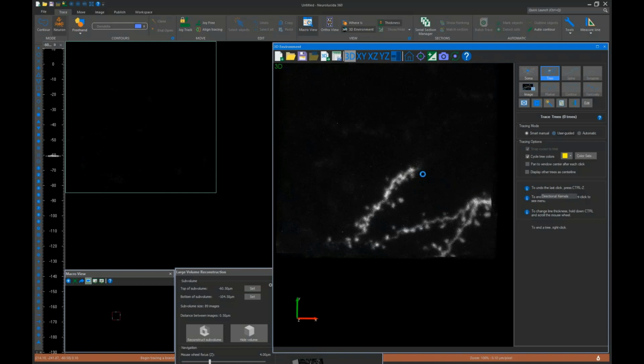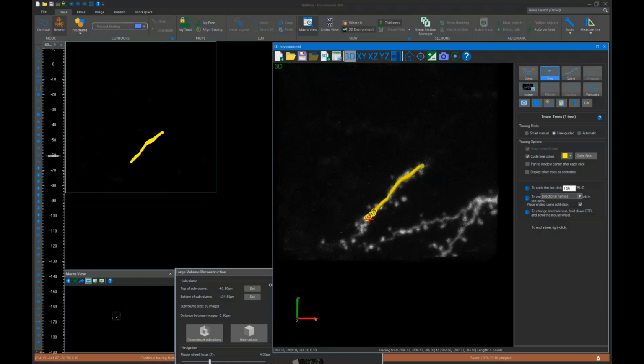So you are protected from having to do that. If you get to a new area and you need to test a couple of different parameters until you find something that's going to work well, you can select the clear last button in order to wipe out these initial changes so that you can go back and forth a little bit.